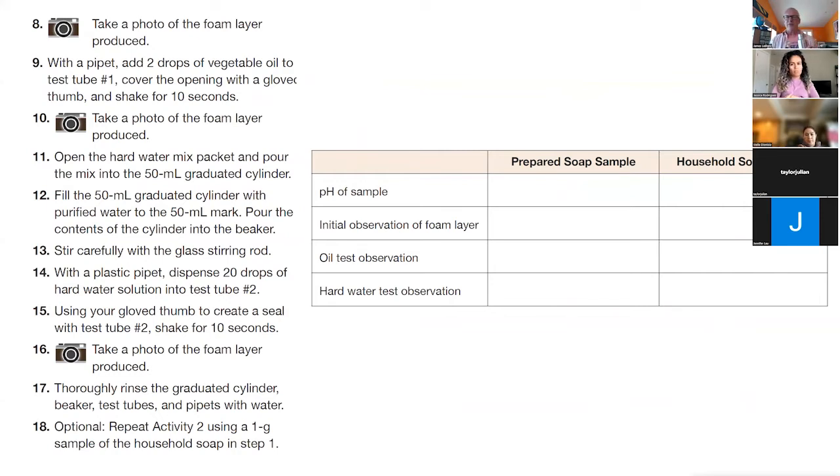Was anyone able to find a 100 ml beaker? No, I wasn't. I think we're just going to have to use a plastic cup. That'll definitely hold 100 mils. These instructions may have been for a kit that had a 100 ml beaker in it, but we only have the big one. So you can use the big one if you want. Either you use the 250 ml beaker or you use a plastic cup. Either way, they'll both easily hold 100 mils.